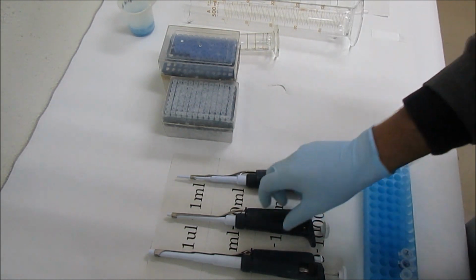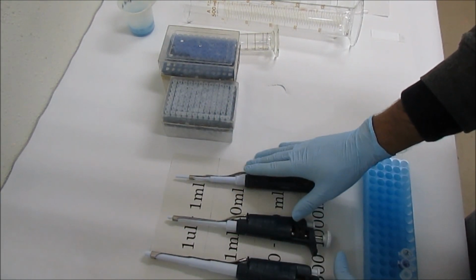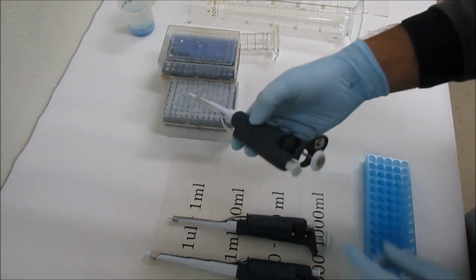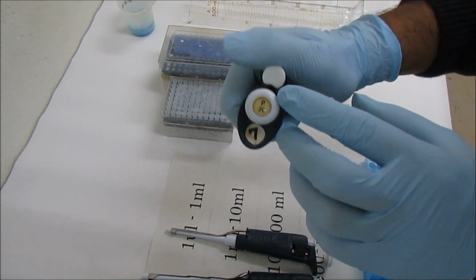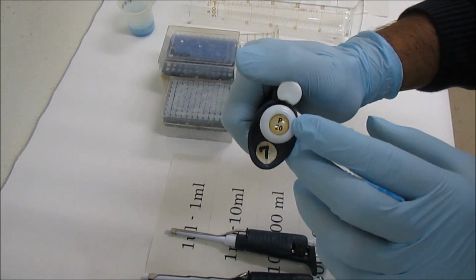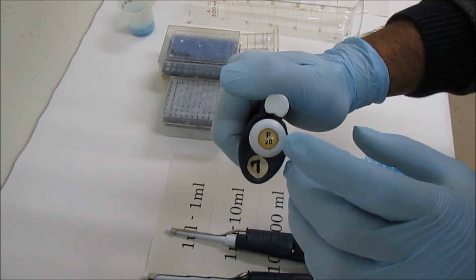The first step is to select the appropriate pipette. Here you see there are three different pipettes. They have different ranges, so let's talk about how they are different. Whatever you see at the top of the pipette represents the maximum volume of the pipette.